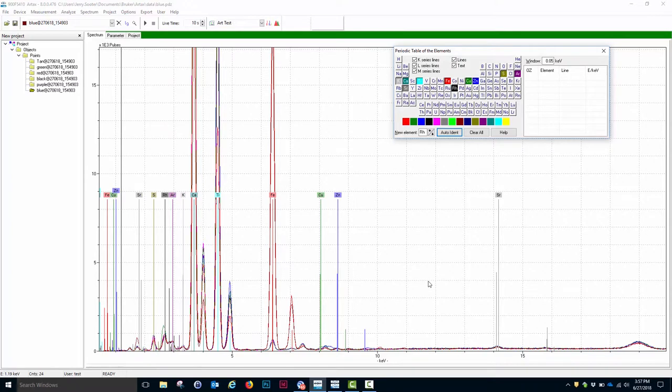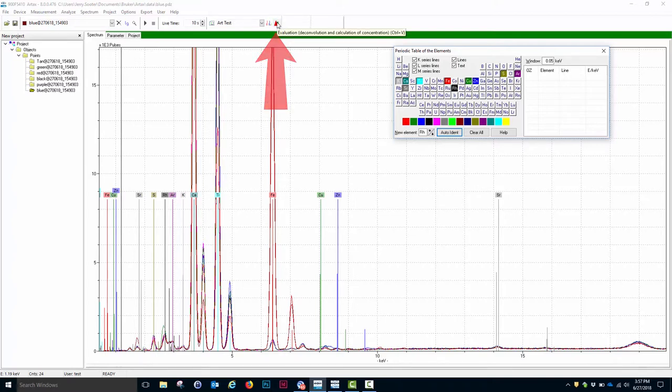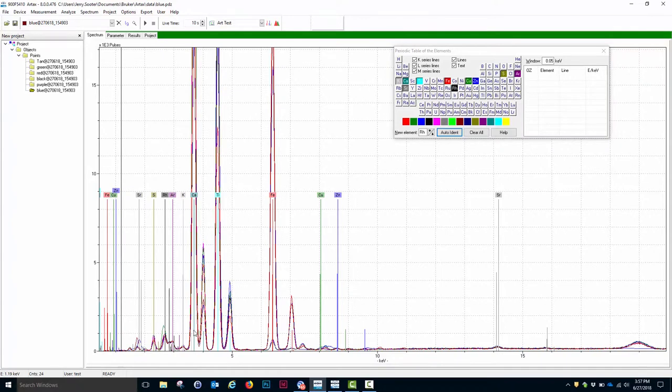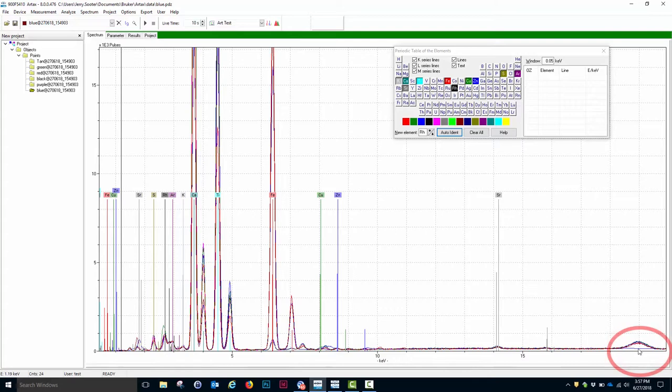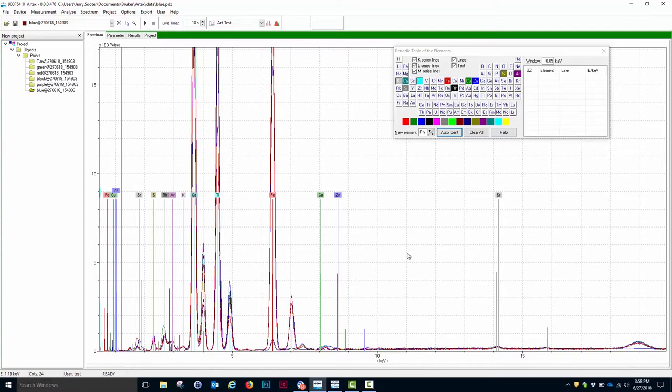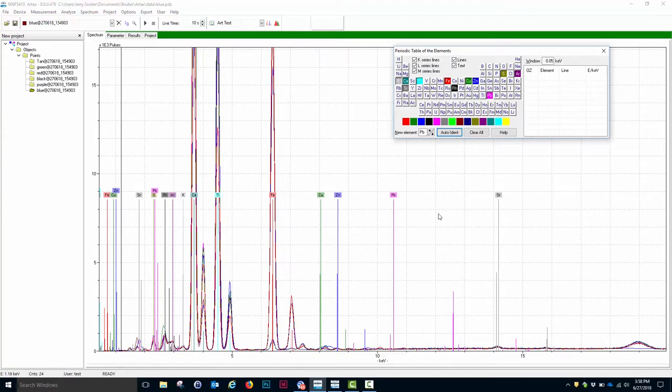The last thing I do before I save this is I can test whether that set of lines fits the data well by clicking this evaluate icon. If you notice, what happens is a blue line is added to the spectra, and what you want is you want that blue line to fit the data fairly well. If you look right here where the rhodium Compton is, we do not have any fit because that line was not identified. You can add and subtract lines from this by simply clicking on additional elements on the periodic table.